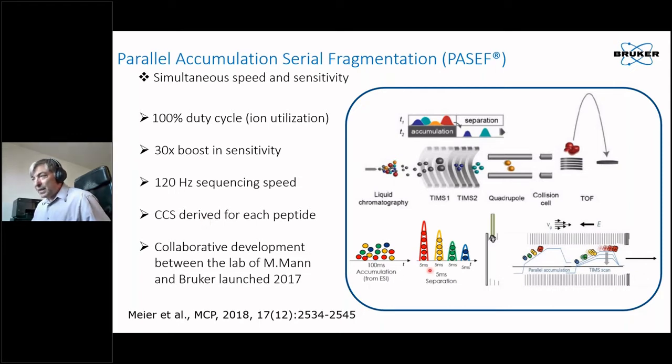And the other beautiful thing that we get out of this is an additional layer of chromatographic focusing, shown over here. Ions that would have eluted continuously over 100 milliseconds now come out in tight focused packets that are only 5 milliseconds wide. So we get big bursts of signal in both MS and MSMS scans.